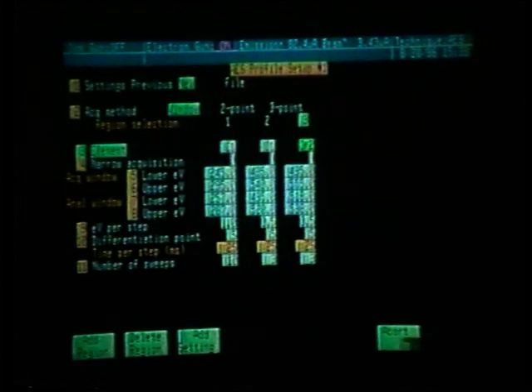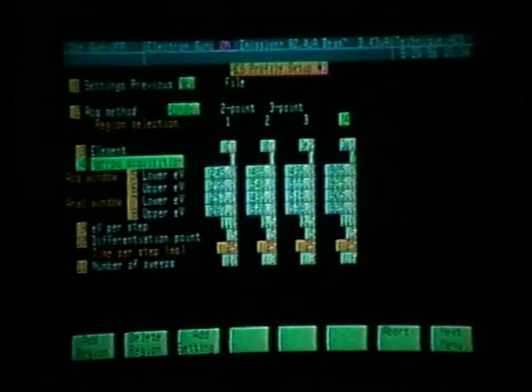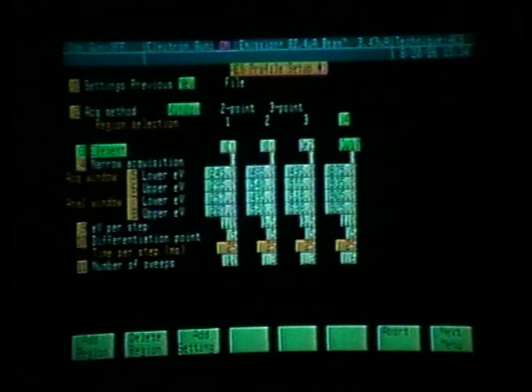Soft key number 1, add another region, the copper peak. CU1 would be the main copper peak located at 920. Again, let's use the wide acquisition parameters, saying no to narrow, and also 3 sweeps on the copper.